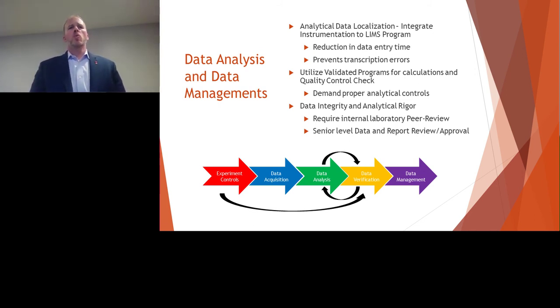So I think the biggest thing to look at is to utilize the programs that you have. Like the LIMS program, for instance, your data is flowing into that and you use that to produce reports. A lot of the LIMS programs have a data management component, so that allows you to store data and retrieve it on a per client basis.